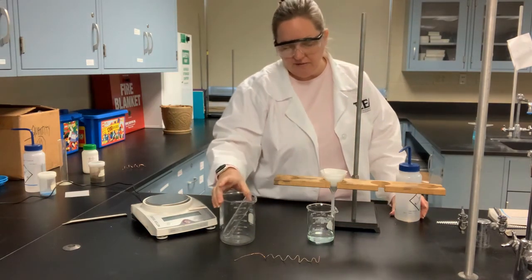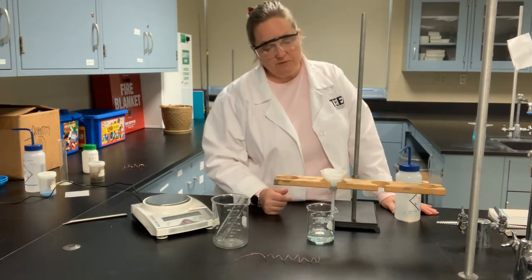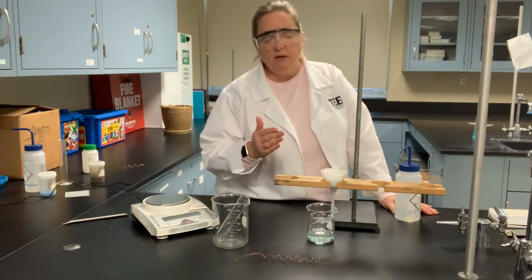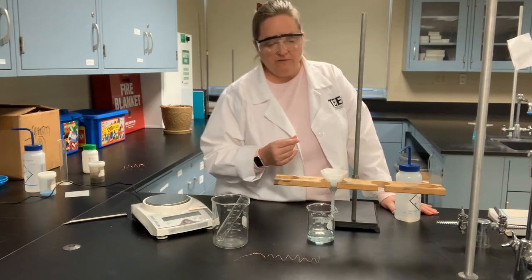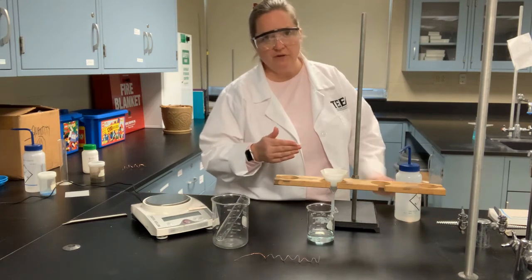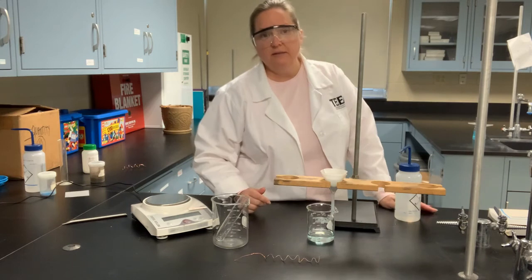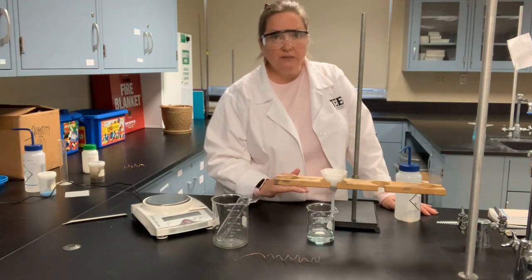So now it's just a matter of letting the rest of the filtrate pass through the filter paper. The silver crystals are being left behind in the filter paper, and once all that passes through and my filter paper appears to be essentially dry, it will still be damp, the way a coffee filter feels in a coffee maker. So I'll remove it from the funnel, open it up a little bit to allow it to dry even better, and let it sit for another 24 hours to ensure that the silver crystals are completely dry.